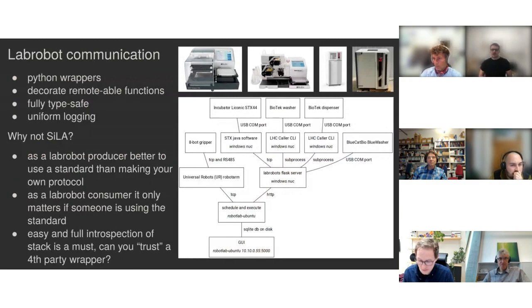Okay, so something about lab robot communications. What I mean by lab robots is all these different devices and machines we have that work on these plates: automated incubator, fridge, plate washers, and plate dispensers.